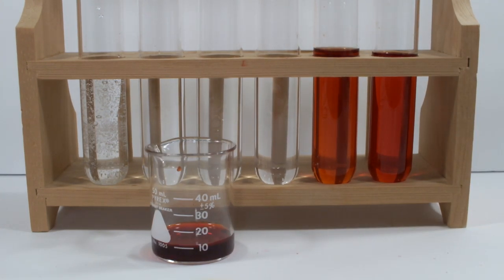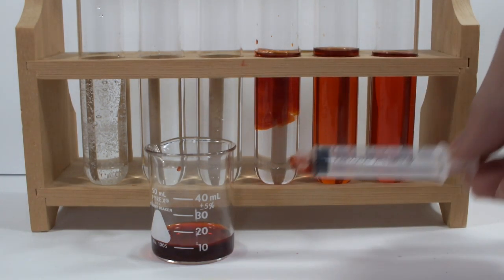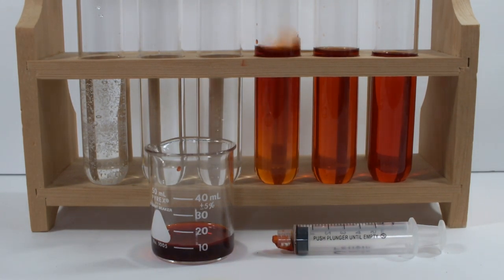Next up is some drugstore 3% hydrogen peroxide. It is an oxidizer, but it's not really a very strong one. So let's see what the ferroin says. Well, apparently it says it's not strong enough to turn it blue.